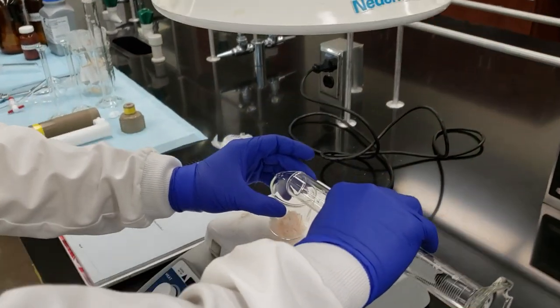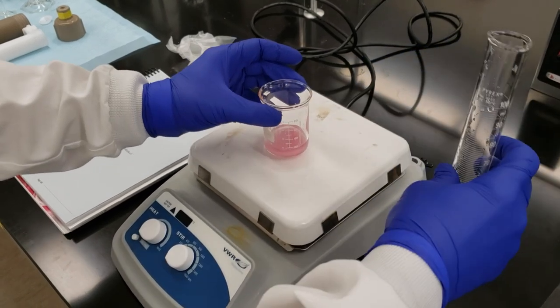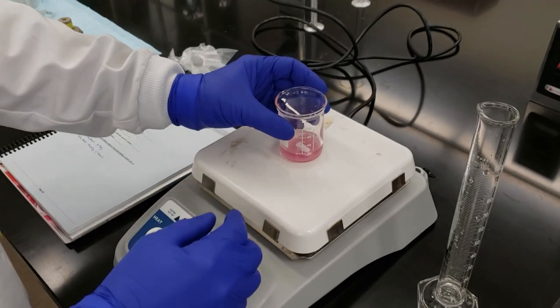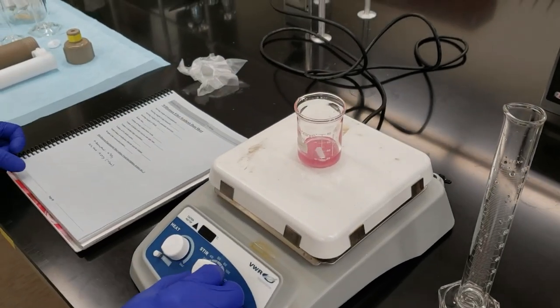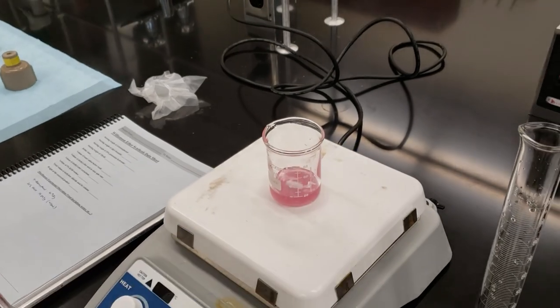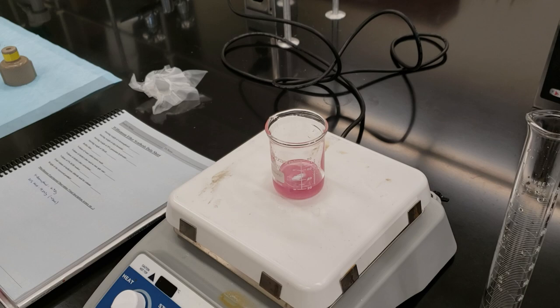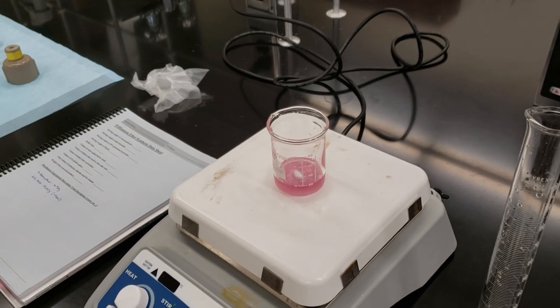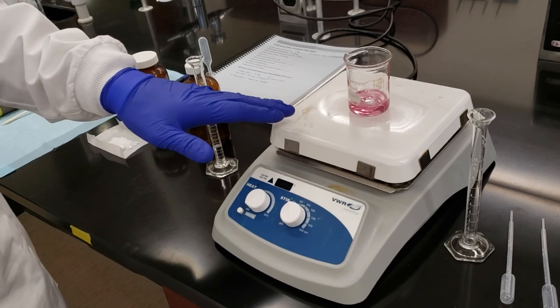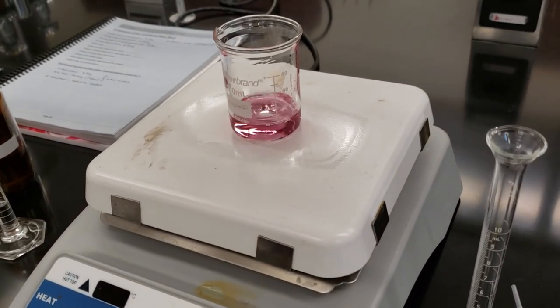We'll go ahead and pour in our KOH. So we've got our pink slash purple liquid. Stirring bar goes in. And we'll let that stir for a couple minutes to make sure our 4-bromophenol is good and dissolved. So our 4-bromophenol solution has finished dissolving. We're going to measure that out in just a second.